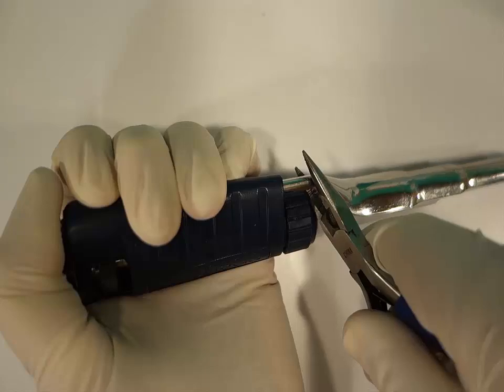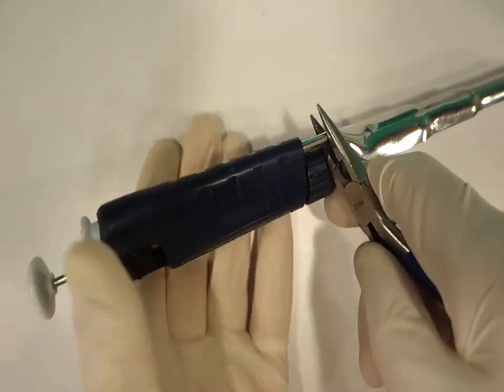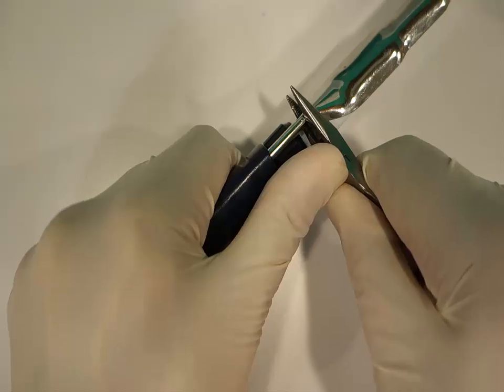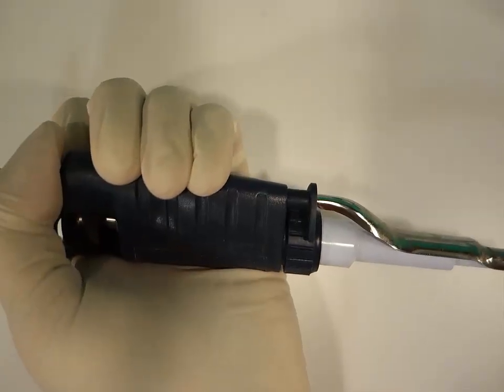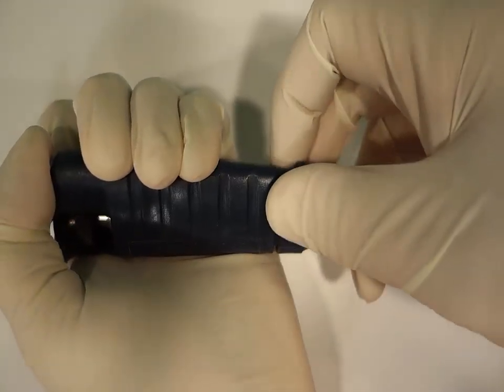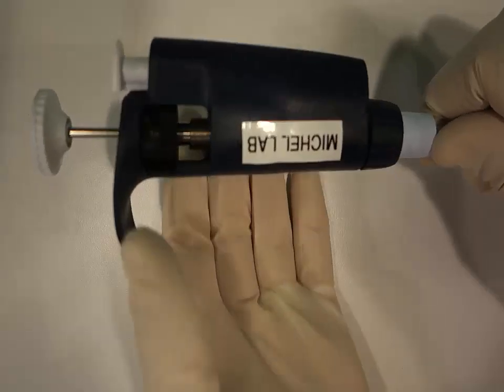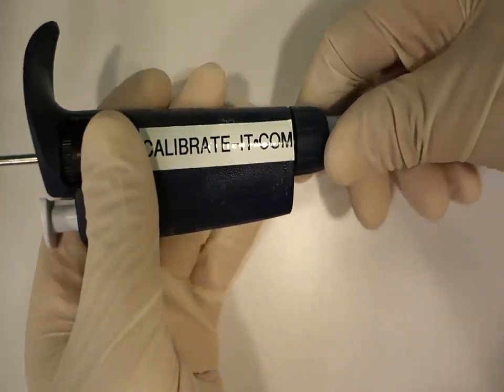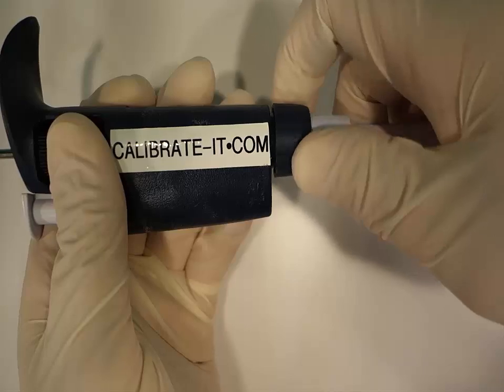If it's held on by friction, you can use pliers if you need to. Or just pull it off. Hold the pipette close to your clean work surface to make sure no parts are lost.